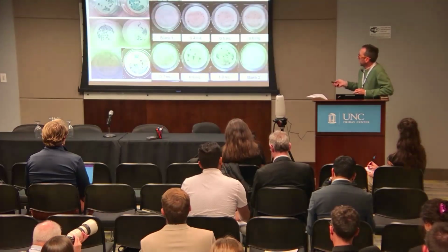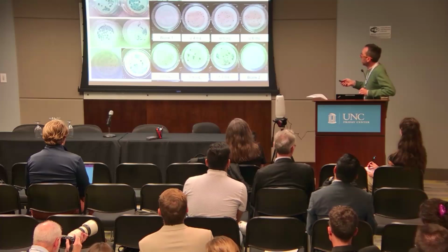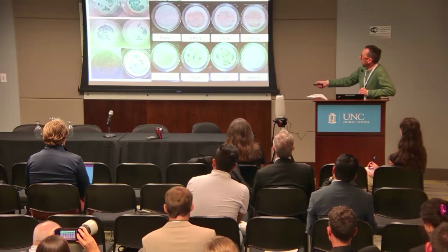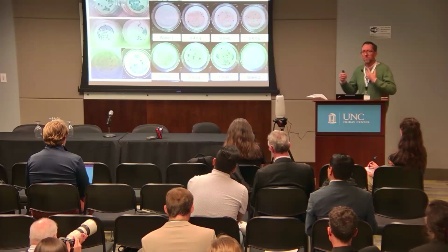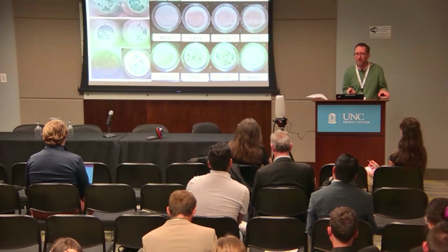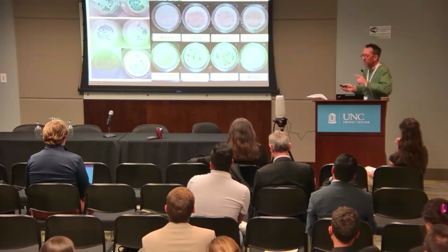So following that, we've done some action research to see the impact of hydration volumes. And this is work done by Christy Chatterley. I don't think she's here anymore at Fort Lewis. But with the same stock, we could see this smearing with the 1 mL recommended volume, even less, some smearing with 0.8 mL. But once you get to 0.7, 0.6, 0.5, 0.4 mL, you're getting good clean colonies without the smearing. So now when we use these tests, we're recommending a 0.6 mL volume. And I've spoken with some people who regularly use DelAgua or Wagtech kits, and they don't measure 2.5 mL. They say, well, we add enough so that it doesn't get too wet. So that is probably the good practice: don't follow the instructions.